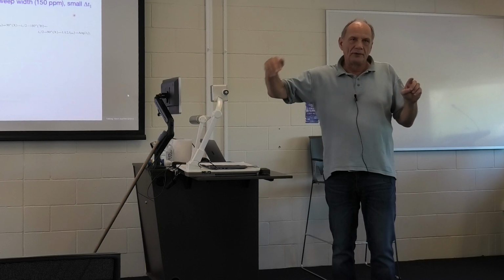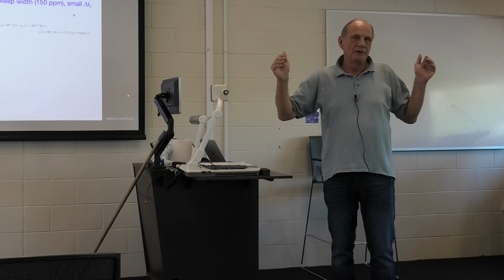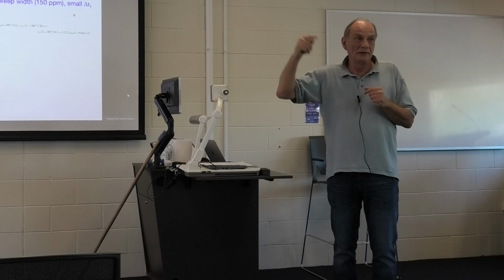But what is very important in the acquisition is that you sample your FID for a long time to get high resolution. The number of increments times the dwell time is the total acquisition time. And this determines what the width of your line is in principle, if the relaxation has not deteriorated the signal before. So if I make a small increment, a small dwell time, I need to have a large number of increments. And that in the indirect dimension costs me a lot of experimental time.